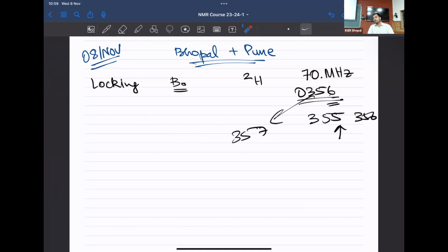So how is this fluctuation detected? We don't detect it when you run the experiment; you see the outcome. If the outcome is bad, then you realize deviations have happened. And when you correct for it, deviations don't happen, then you infer that, okay, those deviations occurred. And this has been a point that people found out when NMR began to start with. When they were able to set up experiments, they realized that if you don't lock, it's going to have drifts and you're going to lose the advantage of NMR, which is high resolution.